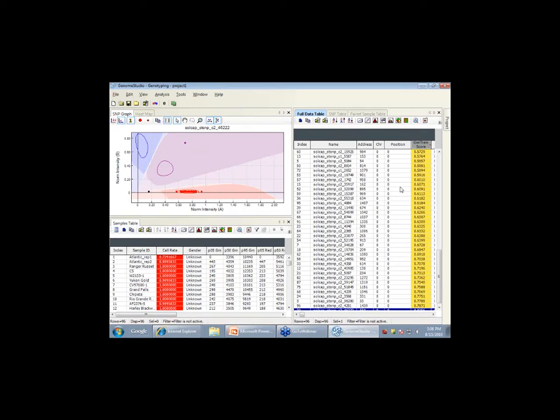Can this technology handle more than 2 alleles? Well, the answer to our data is yes. Look at the GenTrain scores in the middle. You're seeing there are 5 clusters. Can the software handle it? The current version, the answer is no.